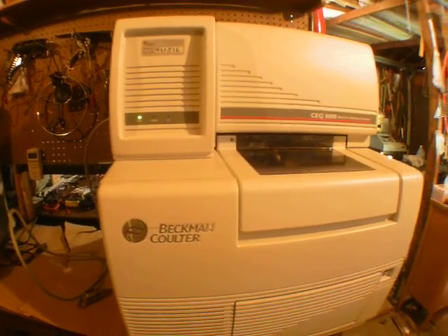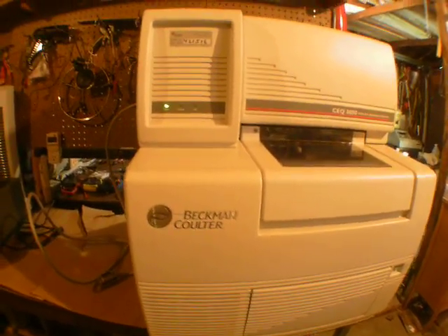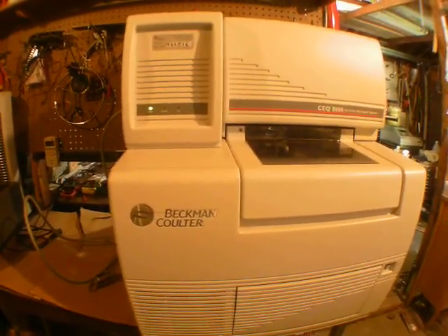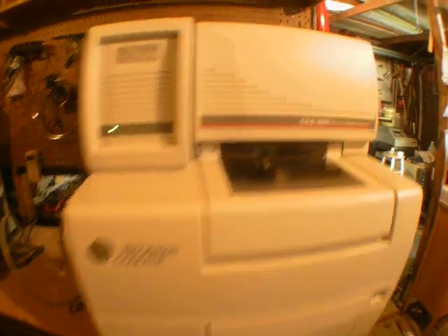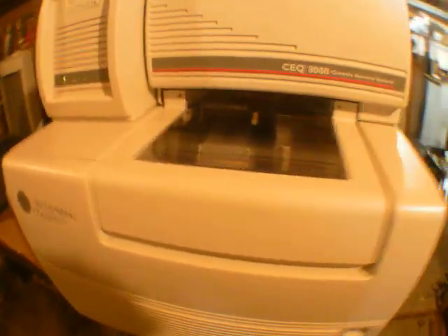Hey guys, I have this machine. As you can see, it's a Beckman Coulter CEQ 8000. It's fully functional, still working as it's supposed to be. Just an overview testing process here for someone who is really interested in this.